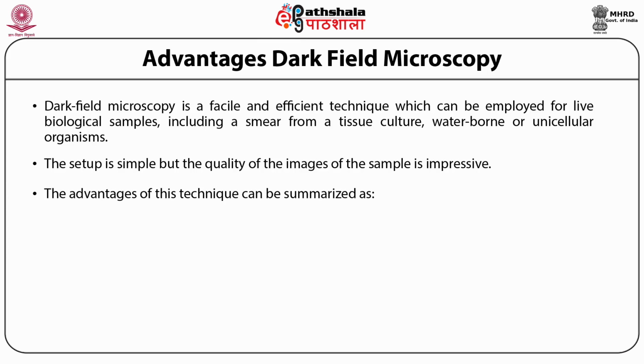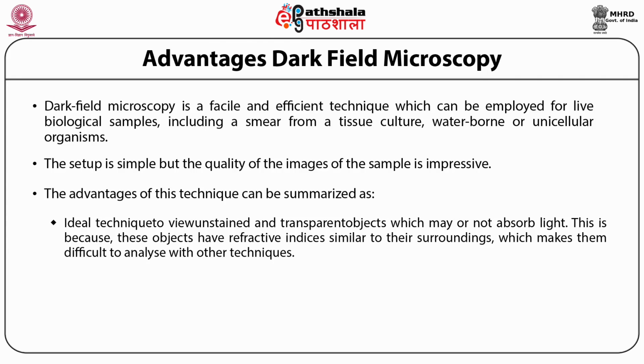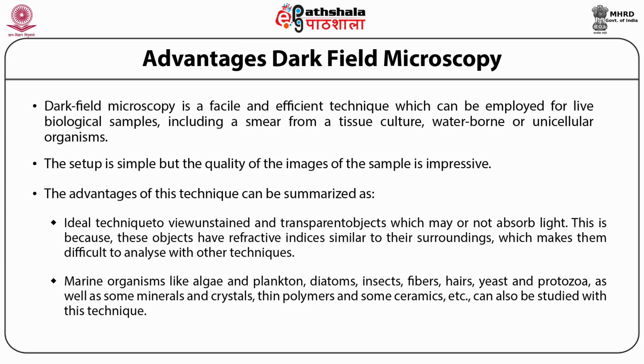The advantages of this technique can be summarized as: first, it is an ideal technique to view unstained and transparent objects which may or may not absorb light. This is because these objects have refractive indices similar to their surroundings, which makes them difficult to analyze with other techniques. Second, marine organisms like algae and plankton, diatoms, insects, fibers, hairs, yeast, and protozoa, as well as some minerals and crystals, thin polymers, and some ceramics, etc., can also be studied with this technique.